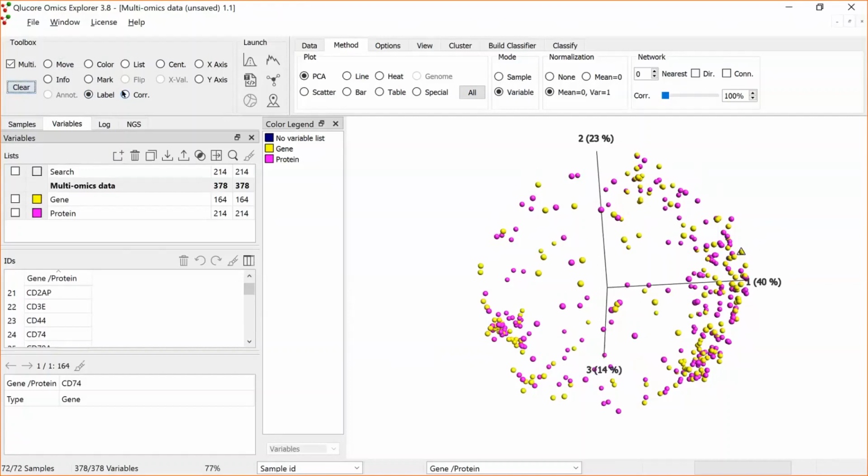So then we switch to the correlation tool here, like that. And that opens up this little dialog. So first I need to mark my gene of interest here by clicking on it, like that. And now you see there's a little cross in there. And then I just drag the correlation slider to the correlation cutoff that I want.